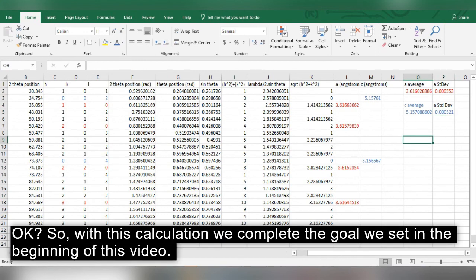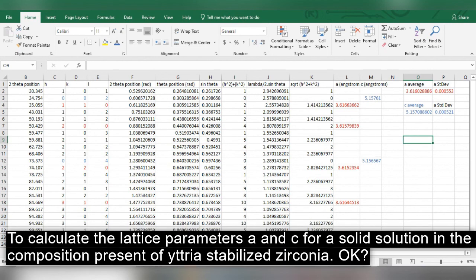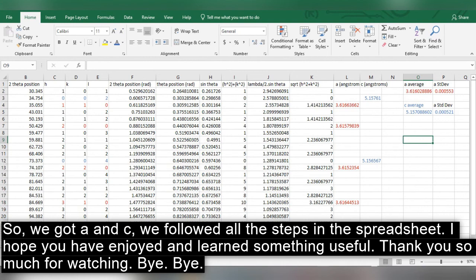With this calculation, we complete the goal set at the beginning of this video — to calculate the lattice parameters A and C for a solid solution with the composition present in the yttria-stabilized zirconia. We followed all the steps in the spreadsheet. I hope you enjoyed this and learned something useful. Thank you so much for watching. Bye-bye.